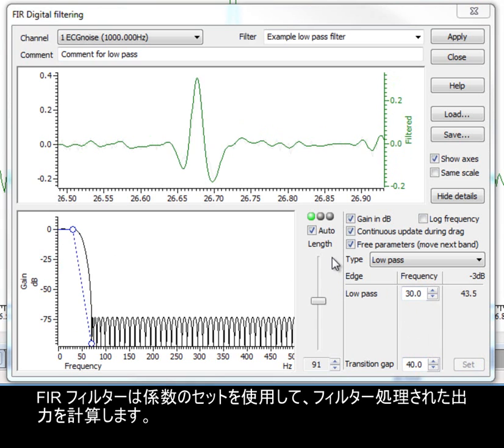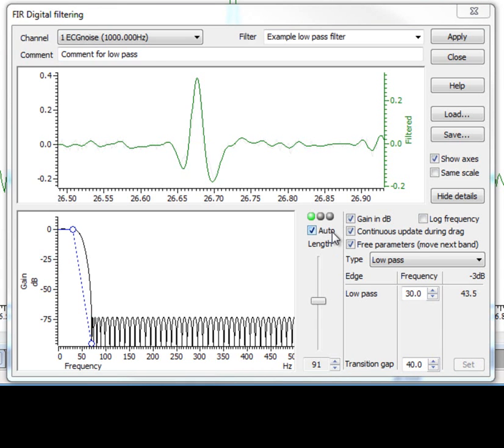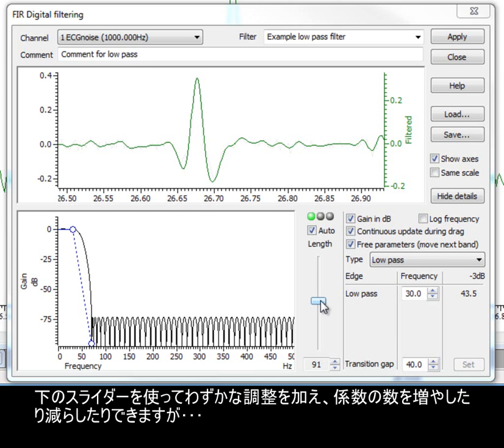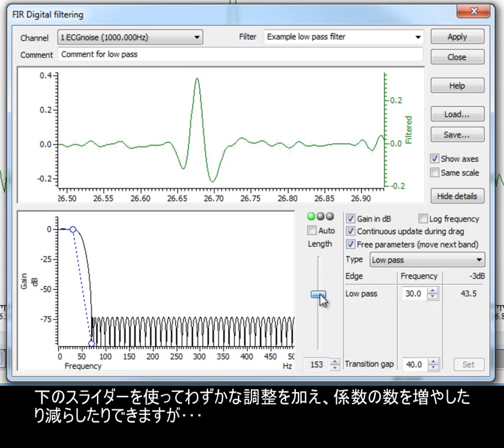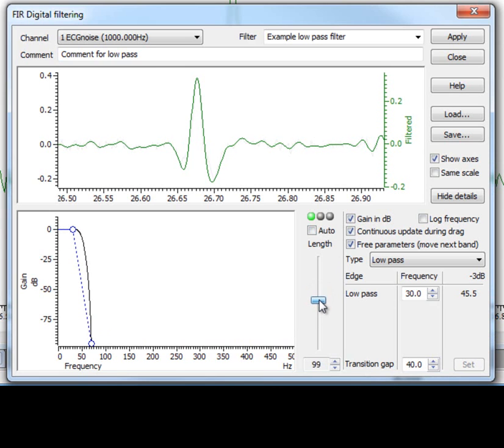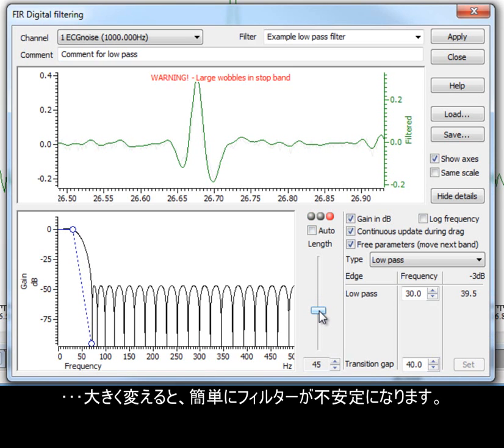FIR filters use a set of coefficients to calculate the filtered output. With the Auto checkbox enabled, Spike2 automatically adjusts the coefficient setting to produce a useful filter. You can make small adjustments to increase or decrease the number of coefficients using the slider below, but large changes can easily produce unstable filters.